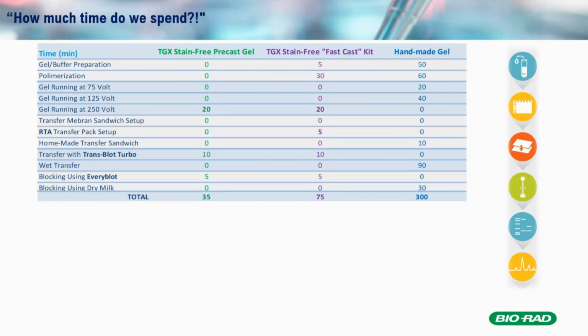how much time we spend running this Western blot, because as everybody has experienced, it takes quite a long time compared to other biological or molecular biology related tools. Preparation takes quite long, running a gel takes quite long, then antibody incubations take quite long, and optimizing all the different parameters takes quite long.